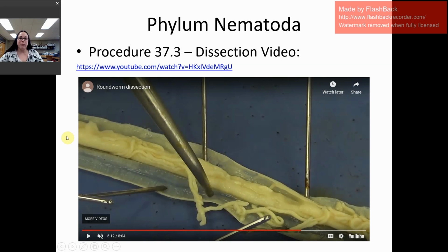If I summarize, the eggs are produced in the ovaries, the little noodles. They move to the larger noodles, which are the oviduct, and then to the even larger noodles, which are the uterus, and it goes all the way up to the vagina that you see over here that has that V shape and then divides in two. And there's going to be a genital pore somewhere over here where the eggs can be released.